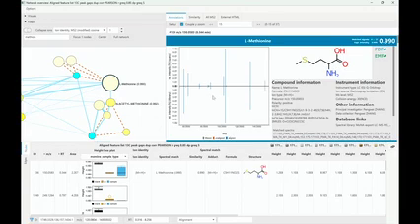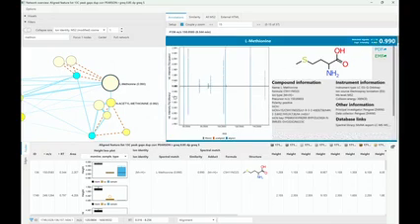And from the library spectra, actually 99.8% of the signals were also matched. Yeah, there's only 4 signals that were not matched, and they're actually very, very minor signals.